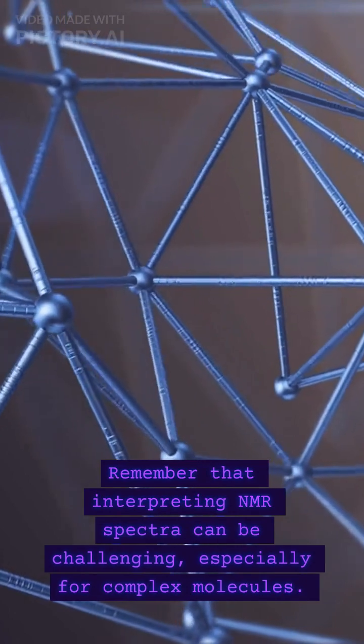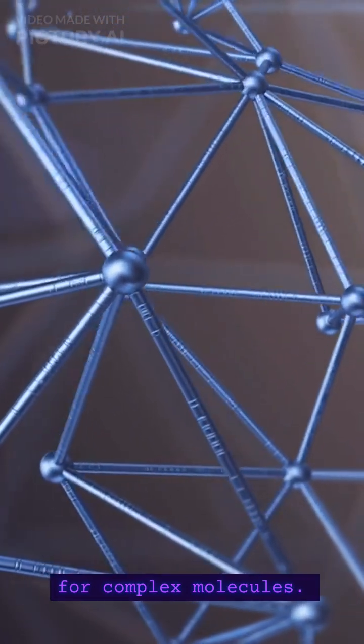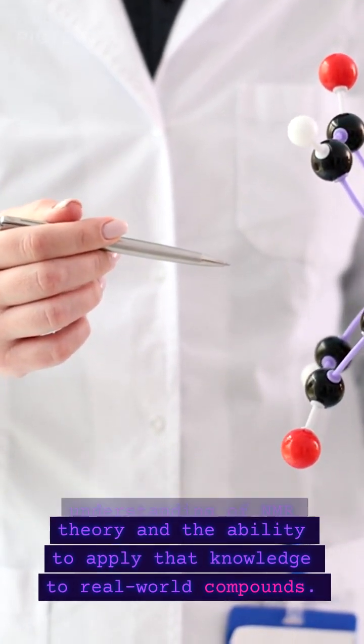Remember that interpreting NMR spectra can be challenging, especially for complex molecules. It requires a good understanding of NMR theory and the ability to apply that knowledge to real-world compounds.